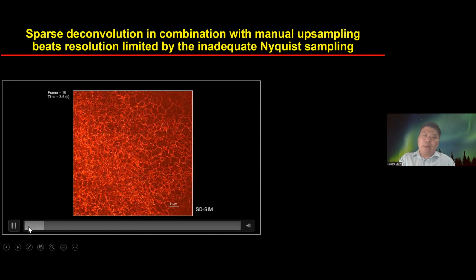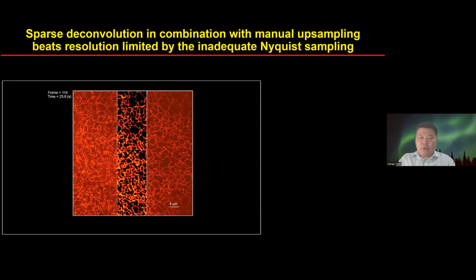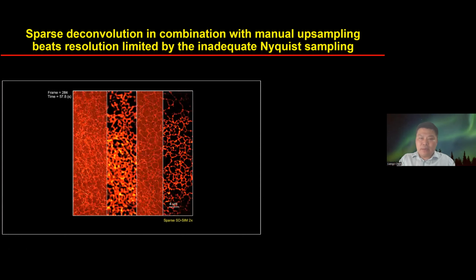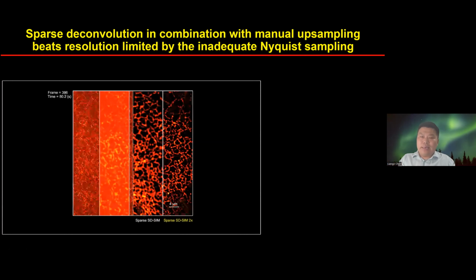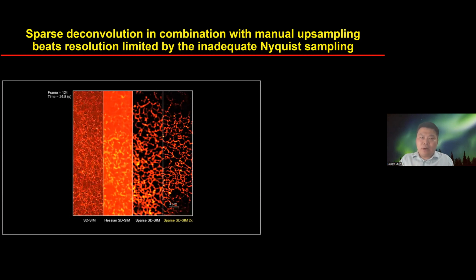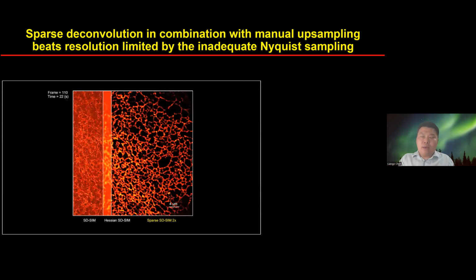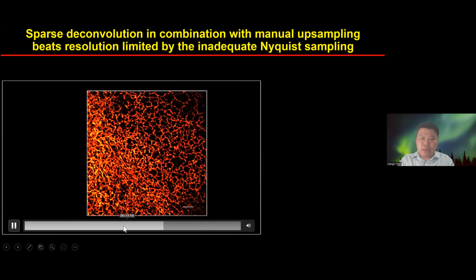Previously, in all the cases we were breaking the limits of fluorescence microscopy. We also know that another factor that may limit your resolution is insufficient Nyquist sampling. For example, if you are using an EMCCD camera on your spinning disk confocal system, because the pixel size of your EMCCD camera is larger, often you do not achieve your maximum resolution because of insufficient Nyquist sampling, as the example shown here.